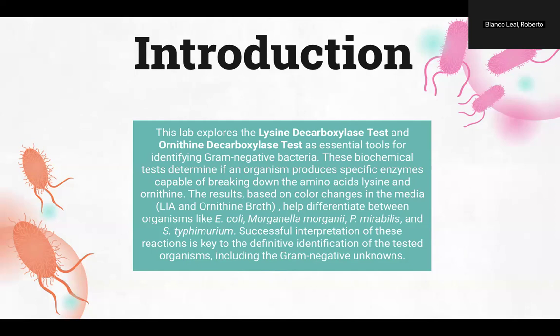The results, based on color change in the media, help differentiate between organisms like E. coli, Morganella morganii, P. mirabilis, and S. typhimurium. Successful interpretation of these reactions is key to the identification of these test organisms, including the gram-negative unknown.